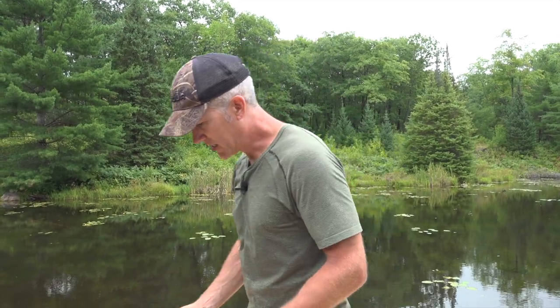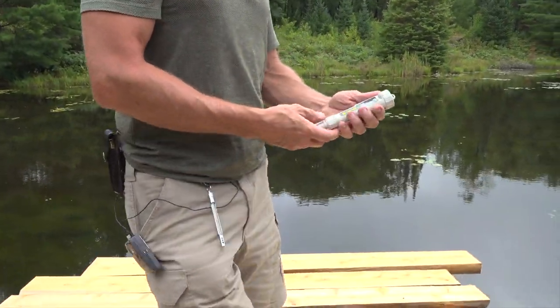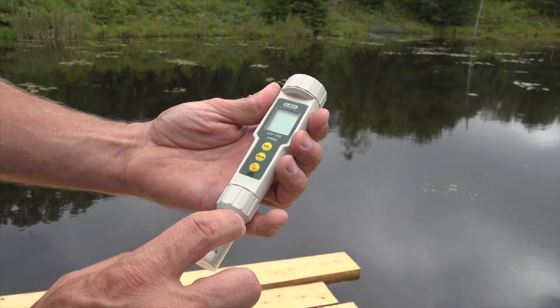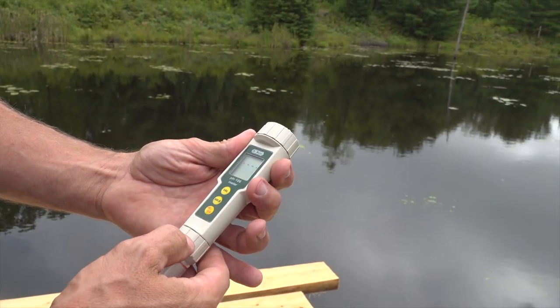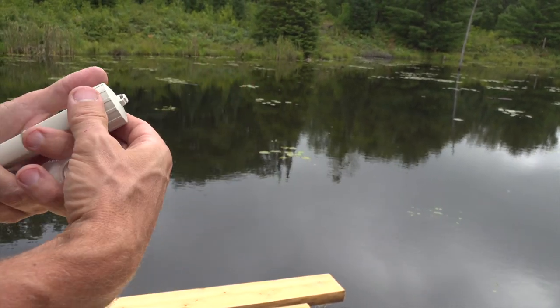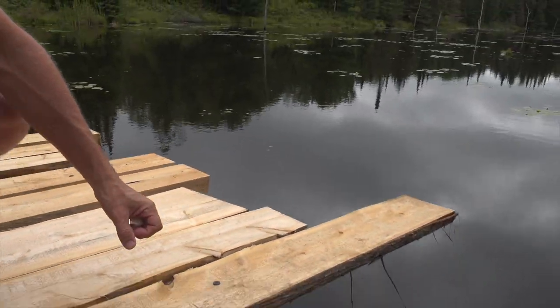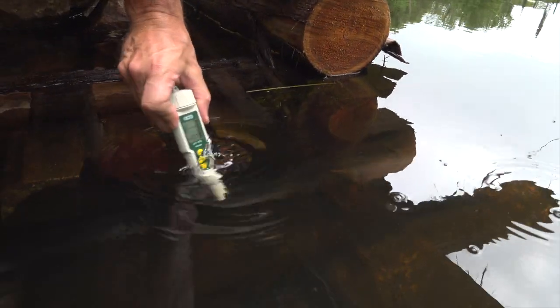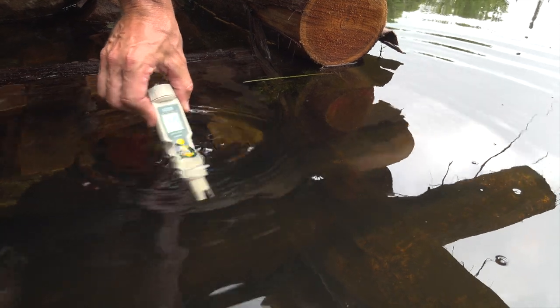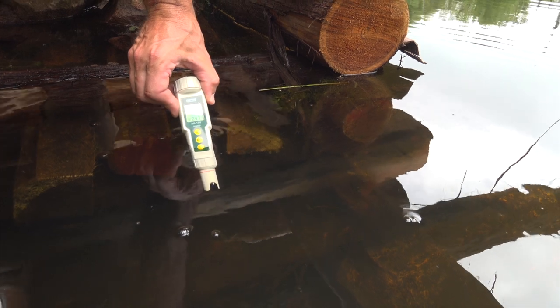We're going to try — let's test the pH first. This is the Dr. Meter pH 100 meter tester. You have to calibrate this thing when you first buy it, and I've done that already so it's more or less ready to go. I have no idea what the pH would be like in here, but let's just check it out. The water is very clear and you basically just wait until it stabilizes.